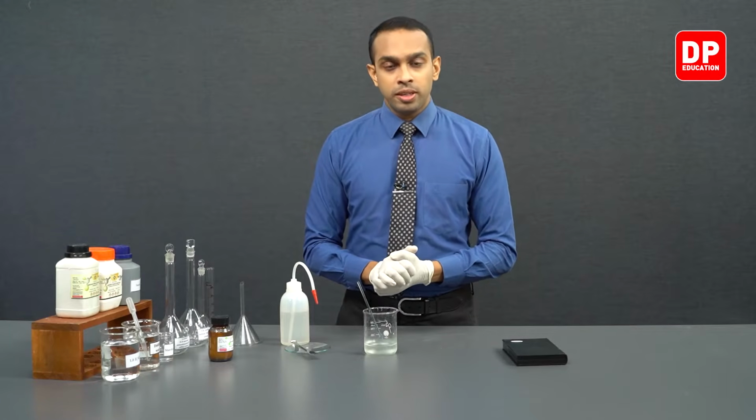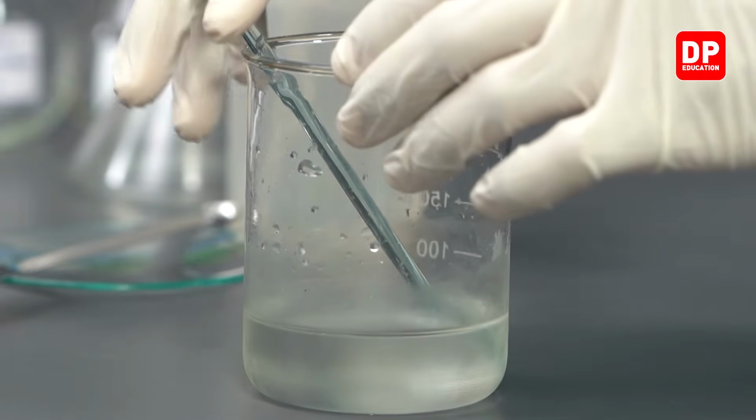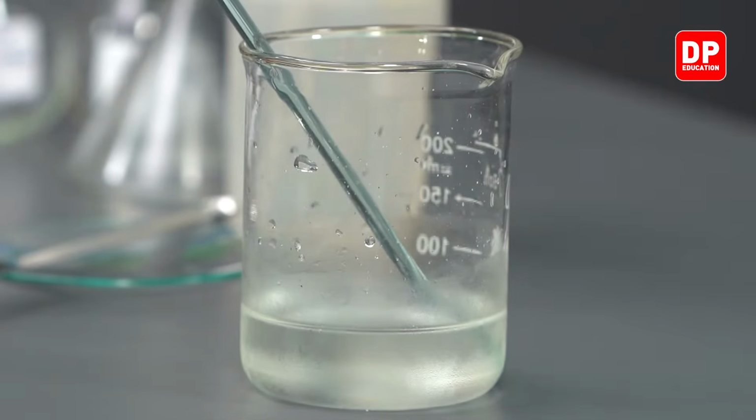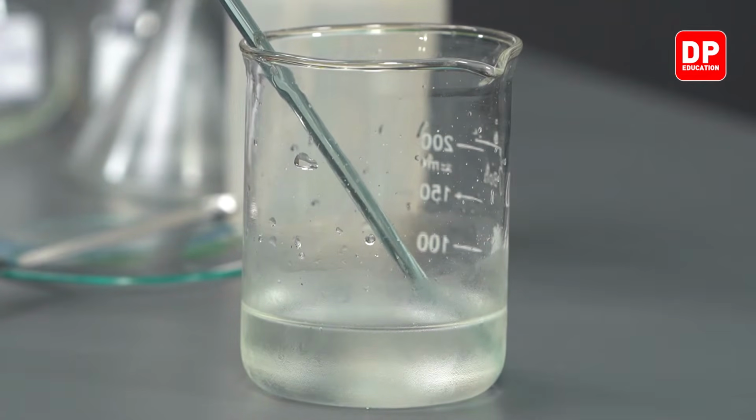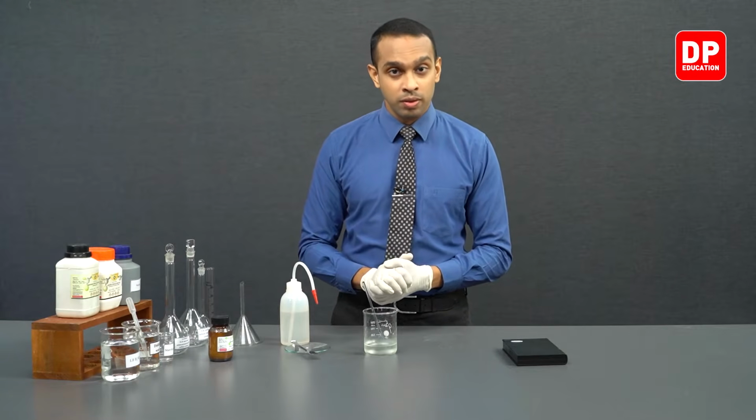Now students, if you observe here, we have dissolved all of the potassium iodide we added, and we have not added over 100 milliliters of water. Actually, it is under 100 milliliters of water in this beaker. But you can make a good observation here.